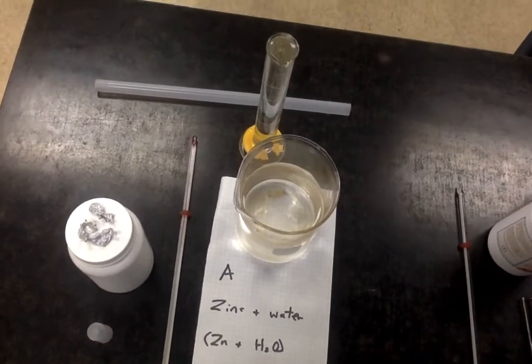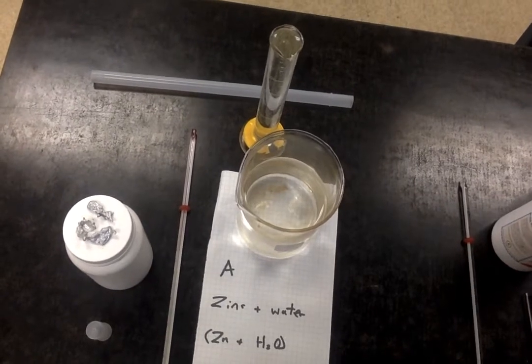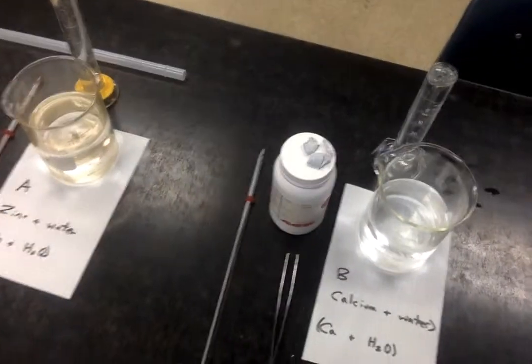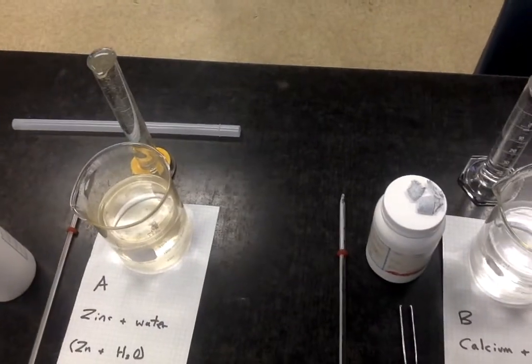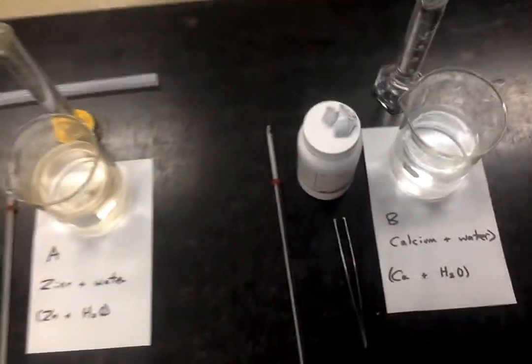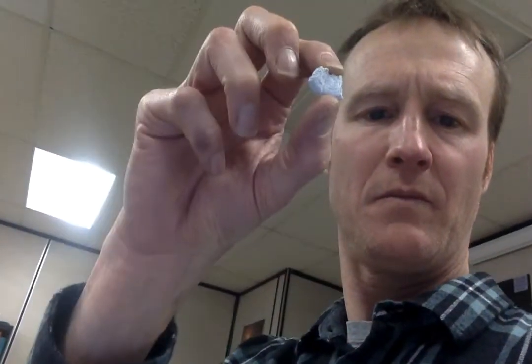For this reaction, here is what I have. It's going to happen in a beaker. I have a graduated cylinder full of water. I have 300 milliliters of water in a large beaker, and I have the zinc. Part 2 is calcium and water. Notice for both of these I have a thermometer. And I have calcium, which you can see as this crusty material right here. This stuff is very hard. It will only break with a hammer.